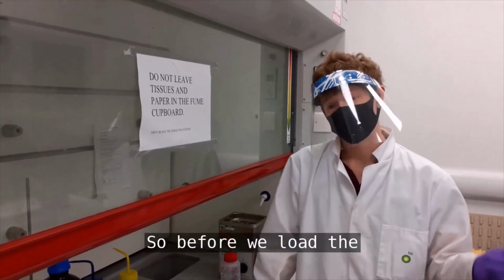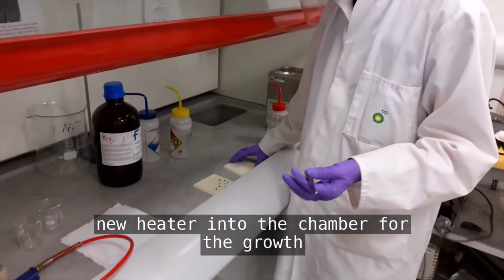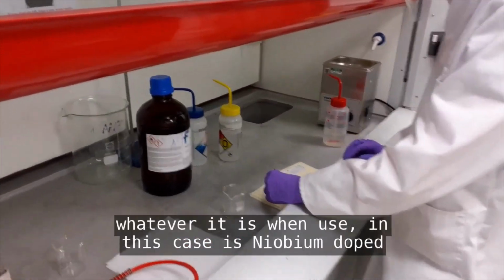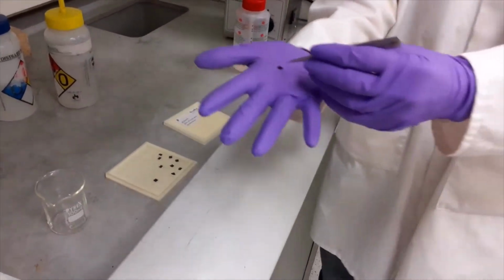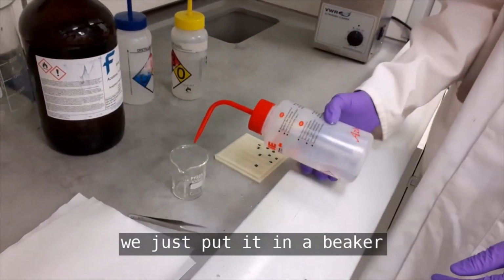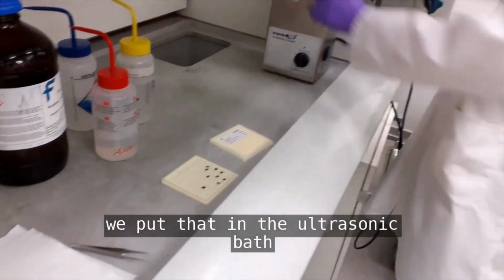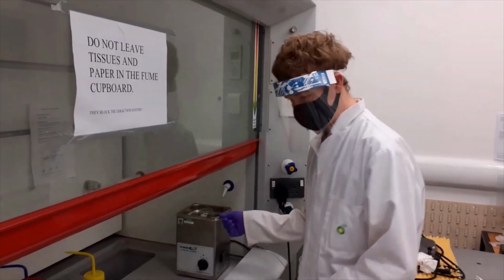So before we load the new heater into the chamber for the growth, we need to actually prepare our substrate. To do that, we take whatever it is we're going to use. In this case, it's niobium doped strontium titanate, and we just put it in a beaker with a little bit of acetone, like so. And we put that in the ultrasonic bath here. So that was 5 minutes in acetone.